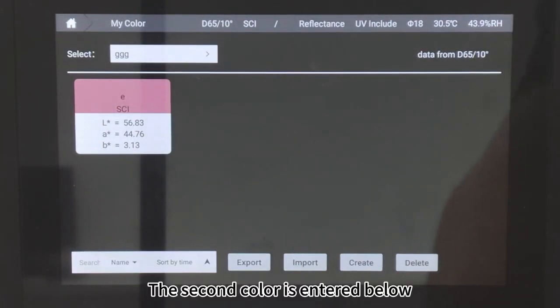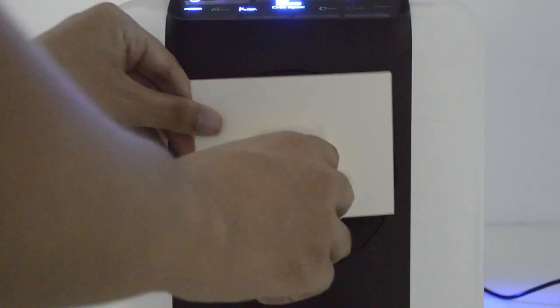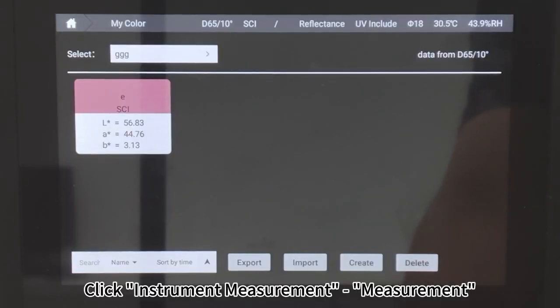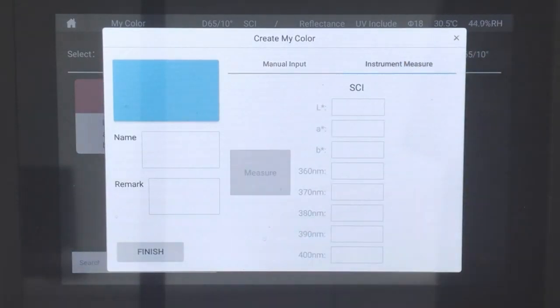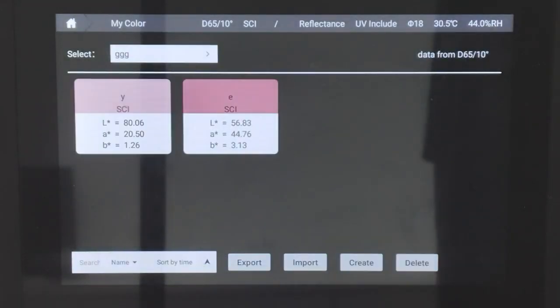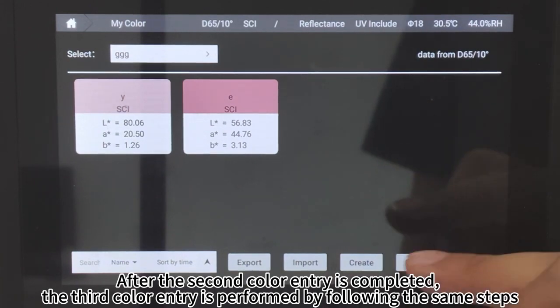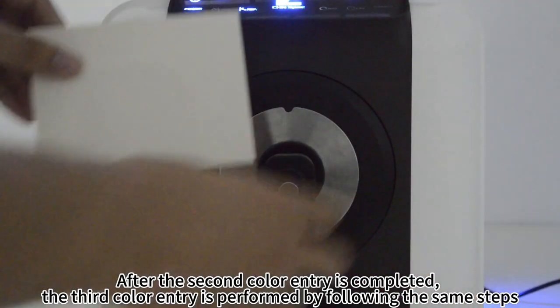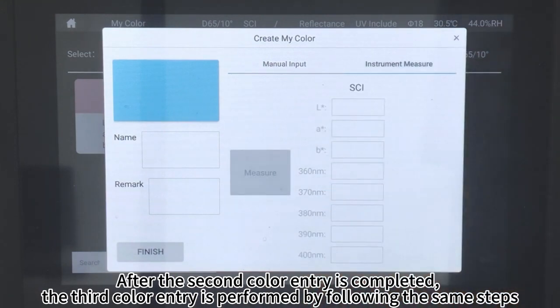The second color is entered below — click Create, then click Instrument Measurement to measure. After the second color entry is completed, the third color entry is performed by following the same steps.